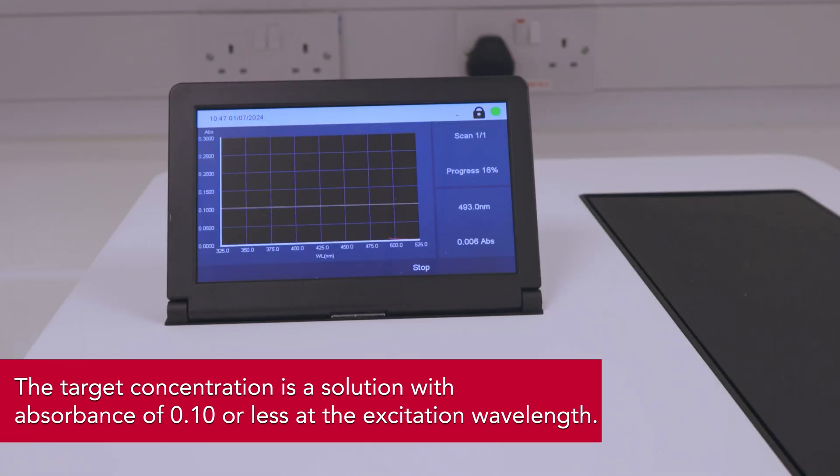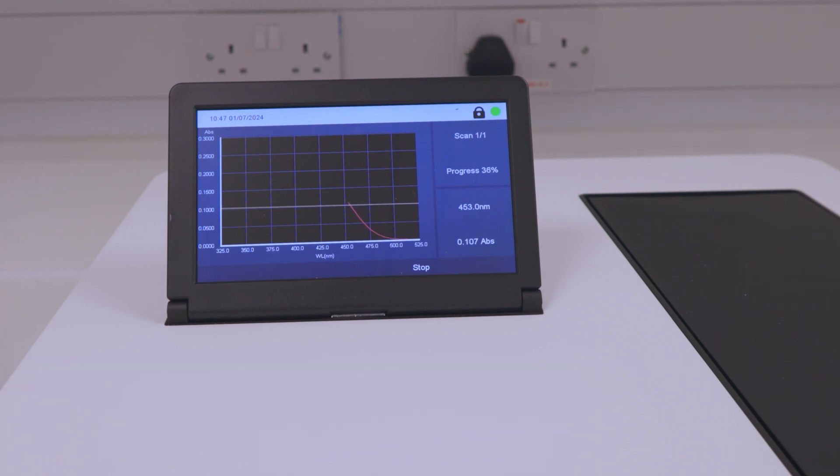Our stock solution here was determined to have a peak absorbance of 0.18. It therefore needs diluted.